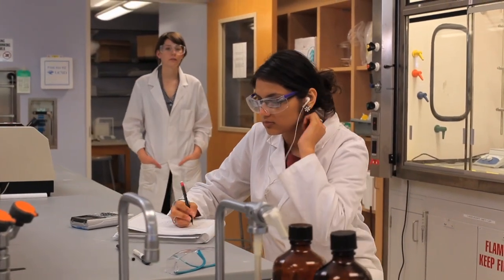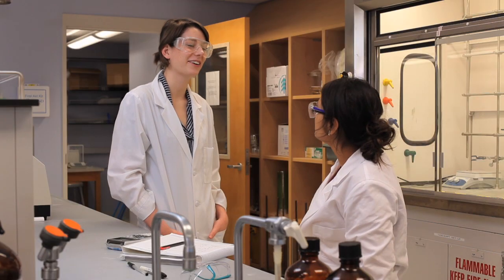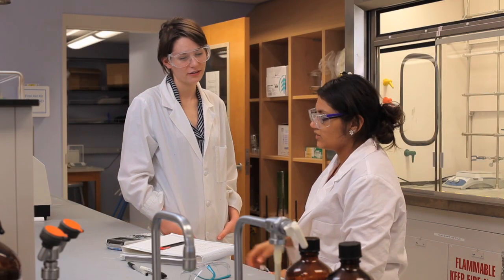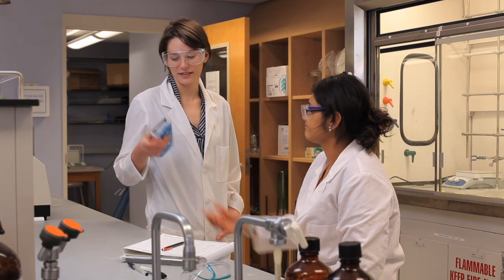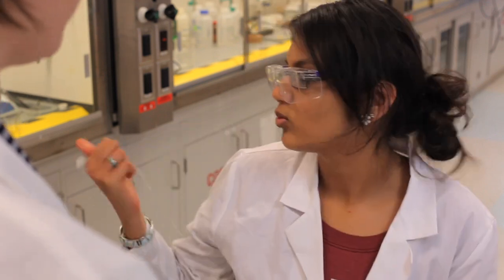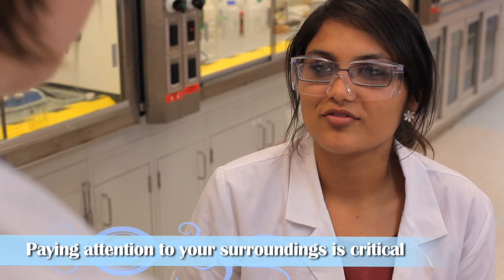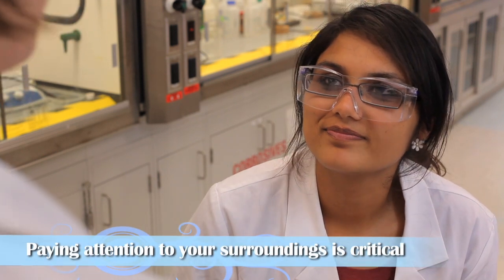Anjali, can I borrow your calculator? Sorry, you scared me. I was just wondering if I could borrow your calculator. Yeah, sure, I'm not using it. Thanks. I don't think we're supposed to be listening to earbuds in the lab. That seems kind of silly to me — it's not like I'm working in the hood or anything. Yeah, I know, it's just kind of unsafe. You can't hear what's going on around you and you might miss some things. You're right. I'll stop listening to them from now on. Thanks for looking out for me.